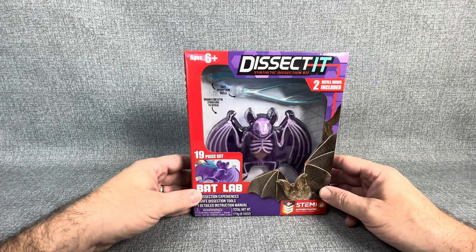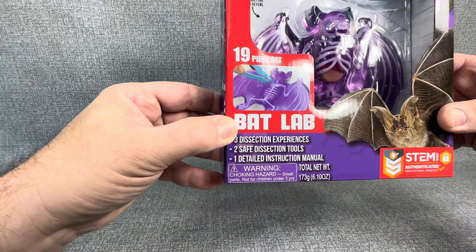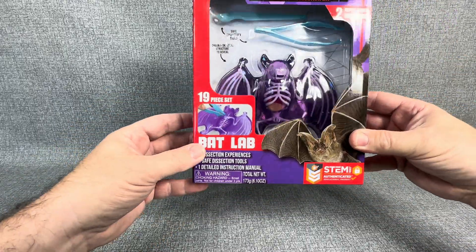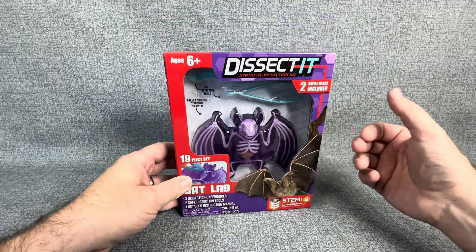Hey everybody, welcome back to the channel JT Open Stuff. Today we're going to be doing one of these Dissecto Bat Labs. This is a 19-piece set and it looks really cool on the inside — I've been wanting to do one of these for quite a while.